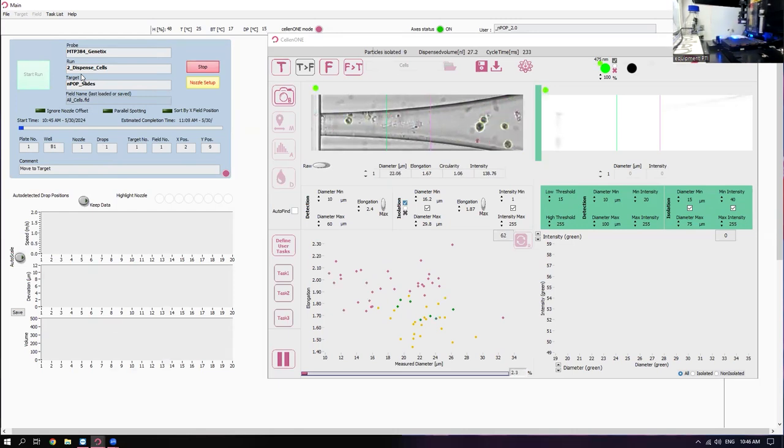Back and forth and back and forth. Got to make sure that the wheels are all tightened down there, otherwise they'll dance across the room. The cell shuffle, they call it.